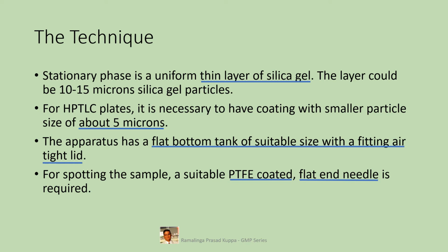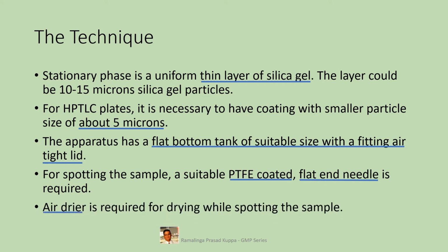You get a nice micron size pore at the center of the capillary tube. Cool it and make a gentle click at the center. You get a nice capillary tube syringe for spotting. It is not too hard to do this. You can try.